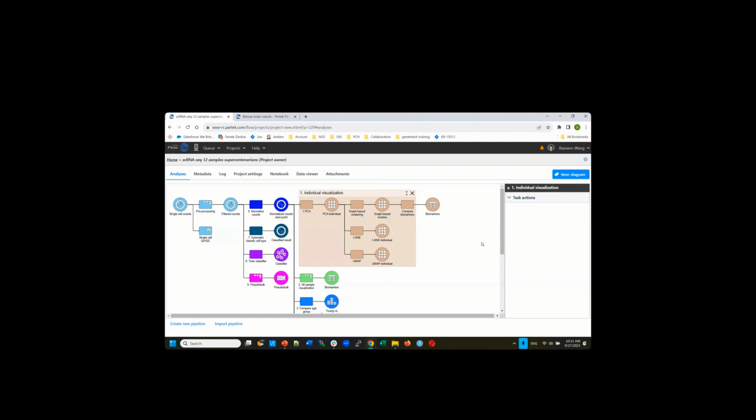So when you try to remove the batch effect, this really depends on your experiment design. Within each batch, you should have your biological replicate. Otherwise, if your biological effect and the batch effect are confounded, then you're stuck.